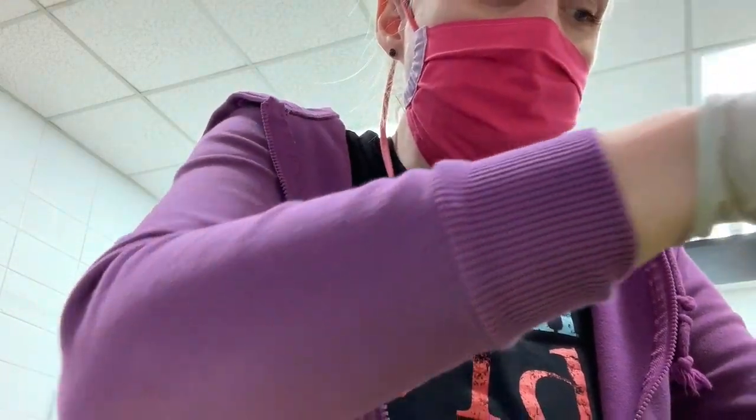This may seem a little silly to you, but especially when you're in the middle of doing something, I like only having out what I still need, so I'm less likely to accidentally use that binding buffer instead of the wash buffer, which is what I need. So you could only get it out when you need it and then put it back if you'd like. I think that's about it.